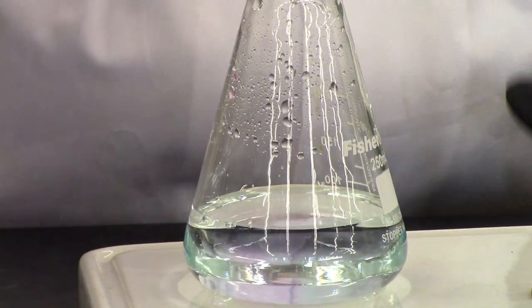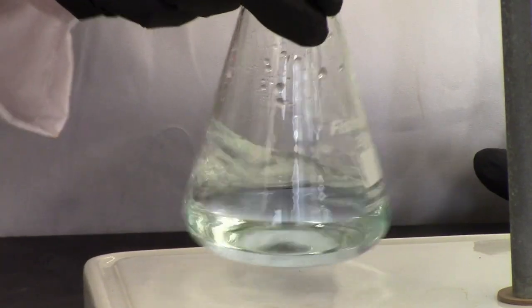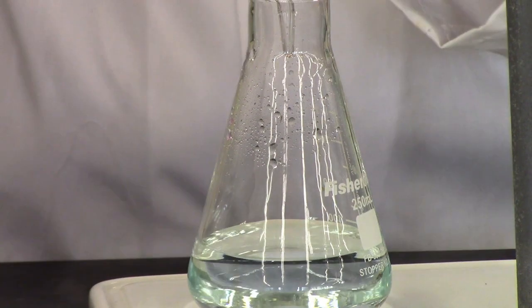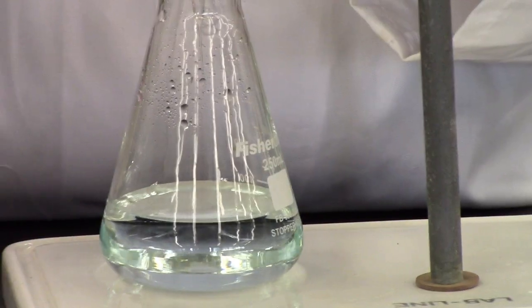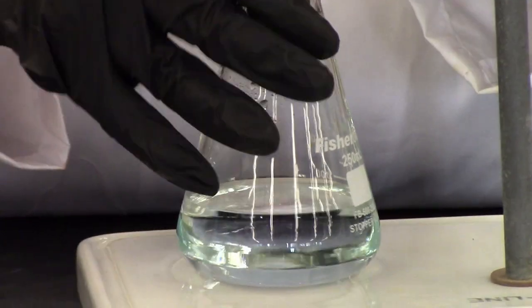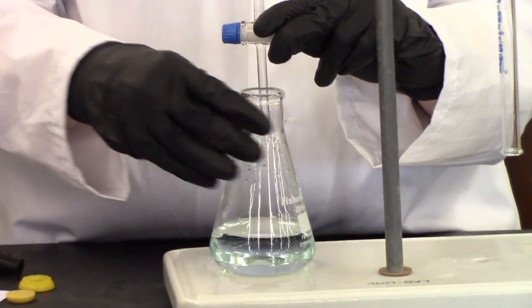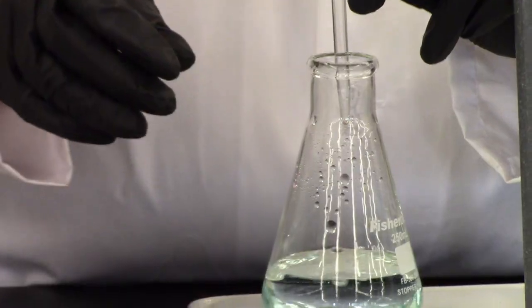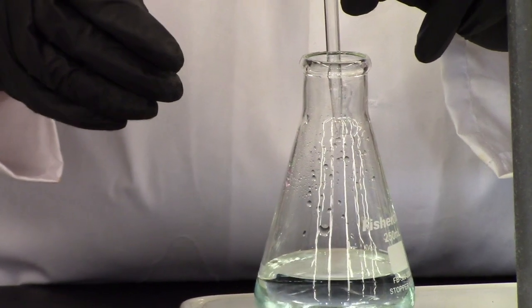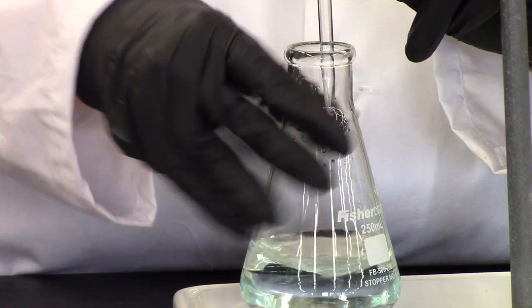This is what I'm talking about. This is not done yet, okay? Because if I mix this, it goes away. We want the lightest pink that you can imagine to persist for at least 30 seconds. That's our end point. Okay, so you just keep going. This is where you want to exercise your patience a little bit, okay? Because if you go too fast, you're going to have to redo it more times. Keep it mixing also.